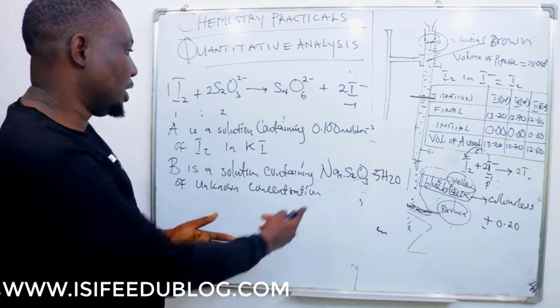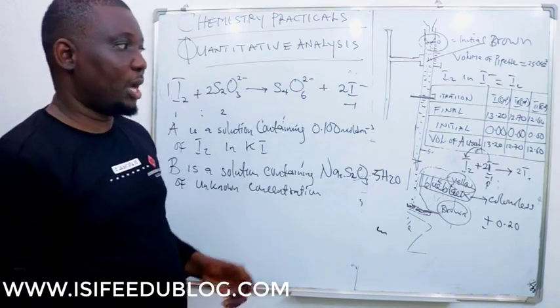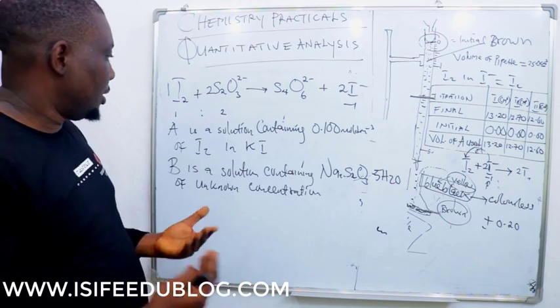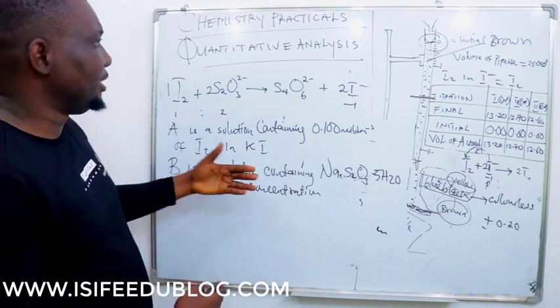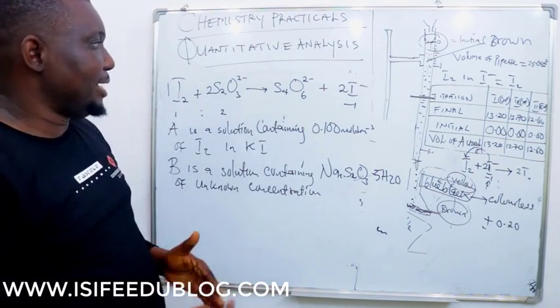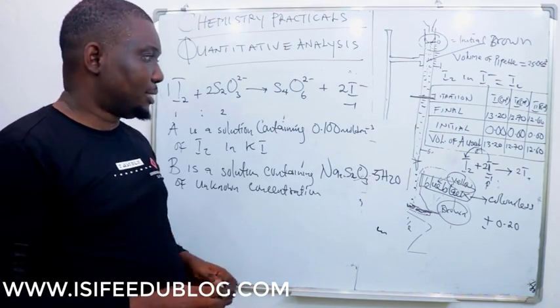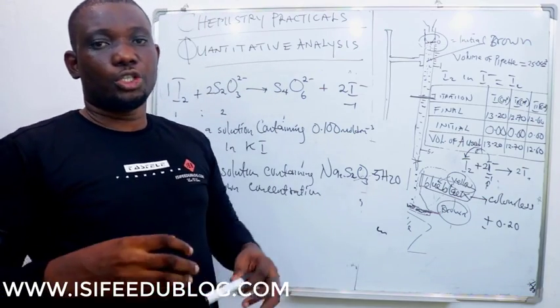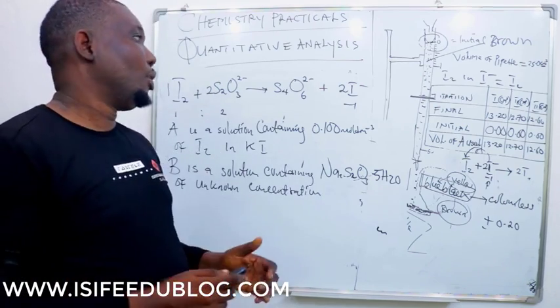So this one is actually going to go in here, and this one is actually going to be here. The method of mixing both until the reaction is complete is what we refer to as titration. So put A into the burette, as we have done, and then titrate it against 25 centimeter cube of solution B, this time using starch indicator solution. Starch indicator solution, not paper. Okay.